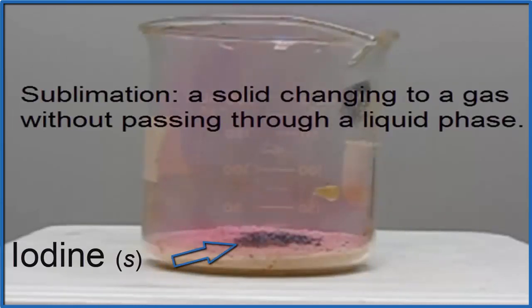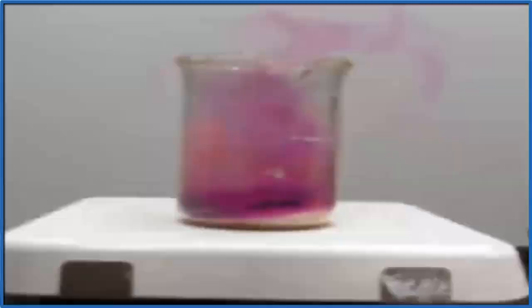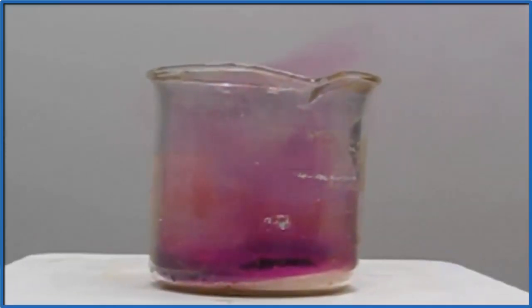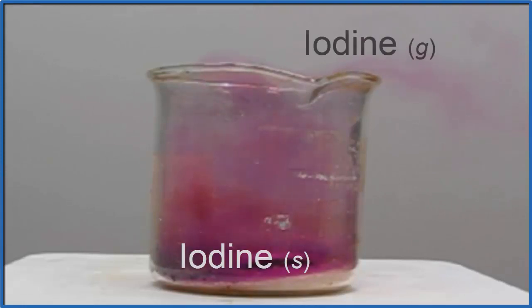So we put solid iodine in a beaker, and we have hot sand there, and immediately it starts to change from a solid directly to a gas. And it doesn't change into a liquid, it's just solid to gas. That's sublimation.